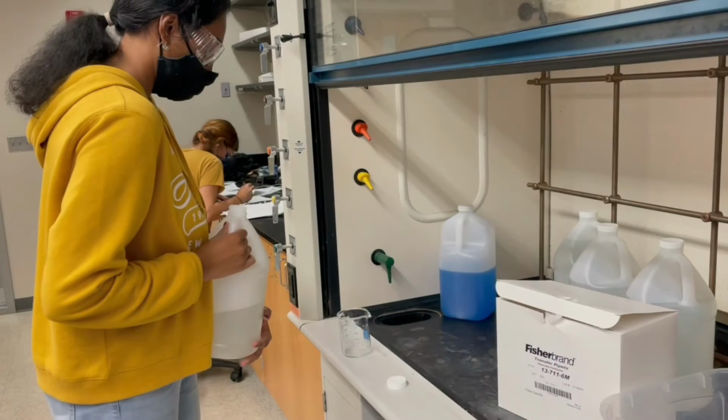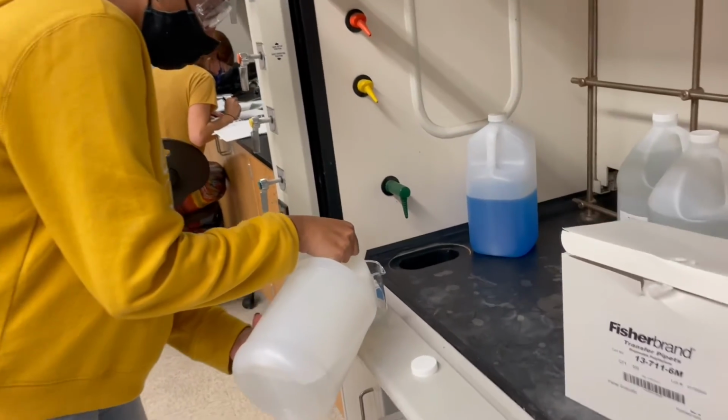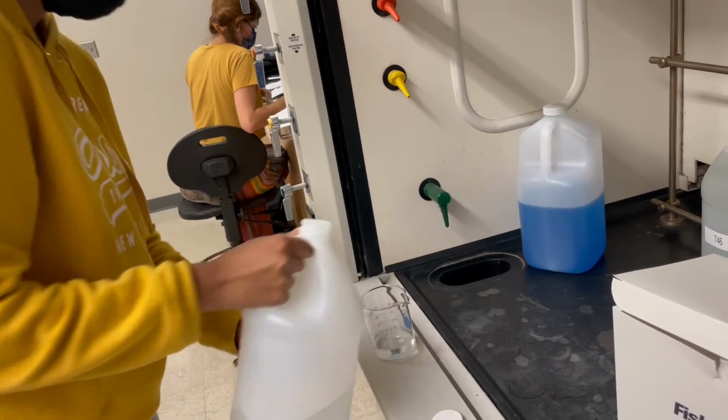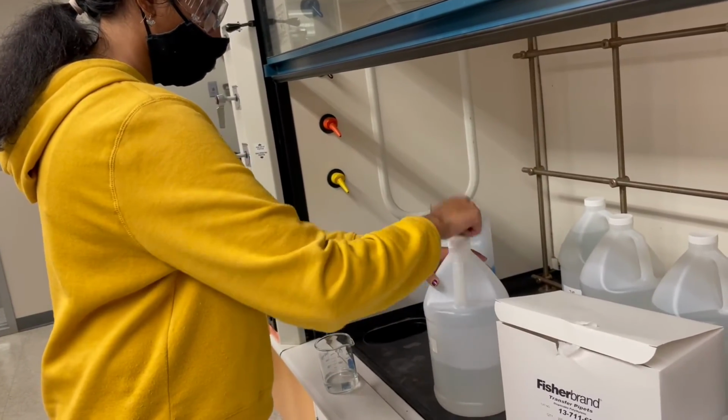Begin the lab by transferring some of the provided stock solution into a smaller container so your group can use it throughout the experiment. Make sure to note the stock solution's predetermined concentration, as you'll need this for the initial concentration variable in your calculations later.